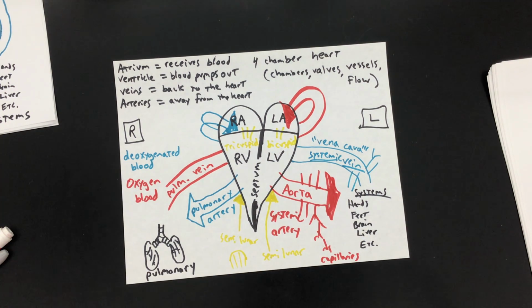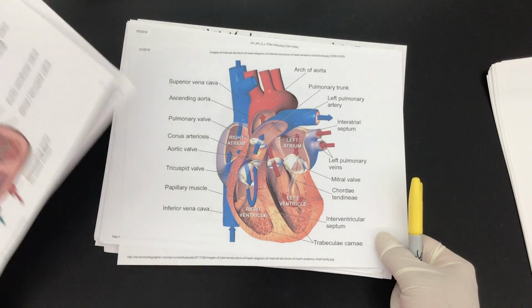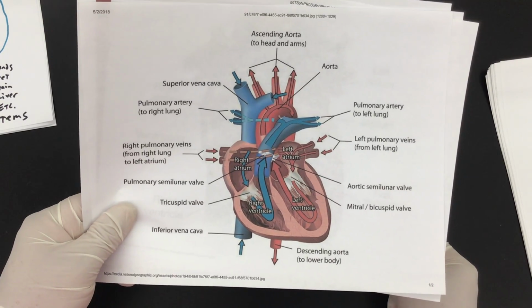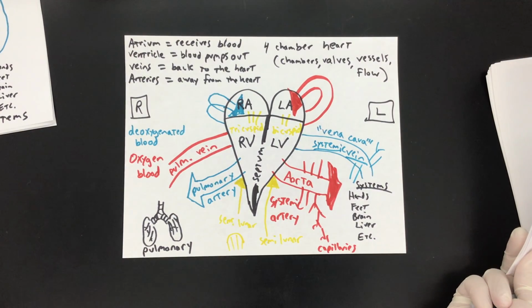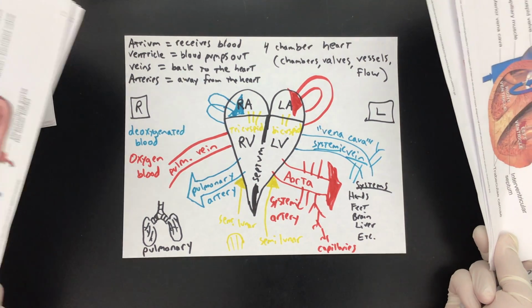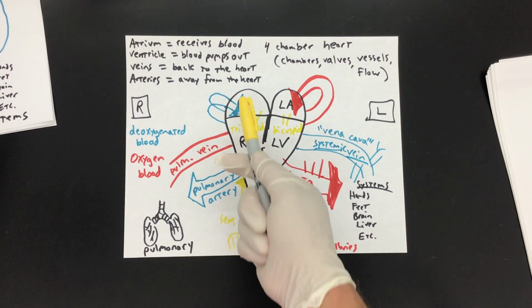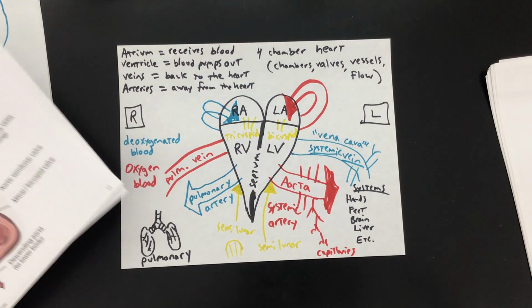So there you go. There's a very simple, crude map for you. Here's some other images that might have looked a little cleaner if we used some of these, but then you kind of get lost in the map. There's this one. You'll see lots of these. There's many different ones out there. But if you draw a simple diagram like this, like the heart, like you would normally draw it when you write I love you on a card for Mother's Day, it's real easy to figure out what's left and what's right, and the tops and bottoms, you can easily separate those little lines like that. Okay, so now let's get into the dissection.